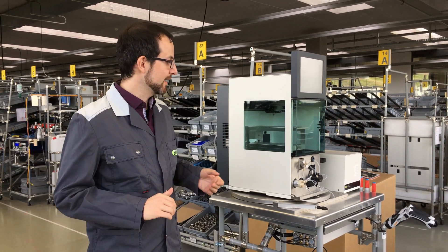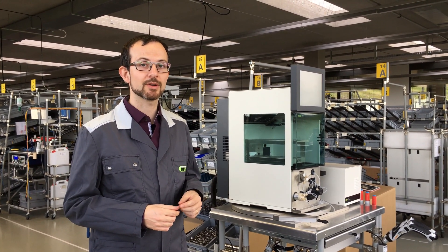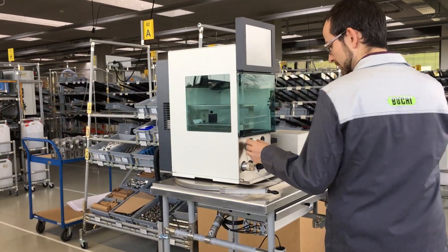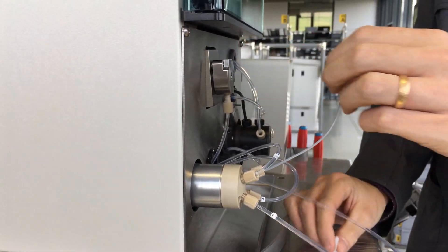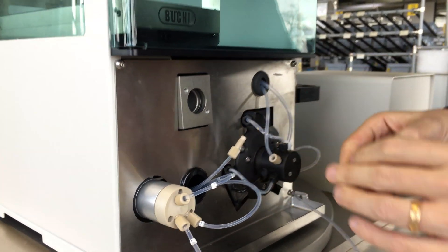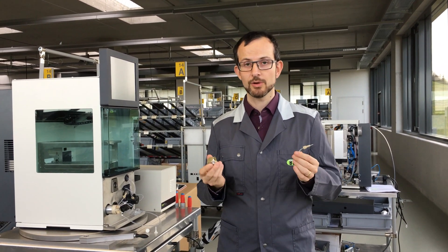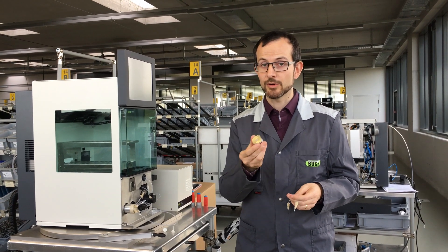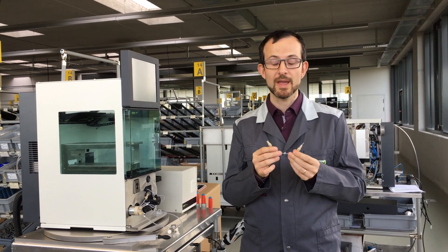The second check you can do is the nebulizer and the transfer line. If they get blocked, the evaporation will be incomplete and the droplets will cause noise on your ELST signal. Here is the transfer line and here is the nebulizer. You can rinse both with ethanol or isopropanol. You may use pressurized air to purge them — please wear your safety glasses while doing so. If you can't clean the transfer line, just replace it with a spare one. Make sure you always have one in stock.